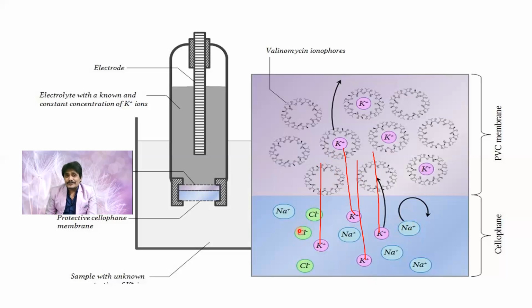So what it is doing, students? It is pulling only one particular type of ion, and during this, these ions are moving towards that particular electrode, and during their movement or activity, the potential is generated in the potentiometer. I hope you got it till now, right?